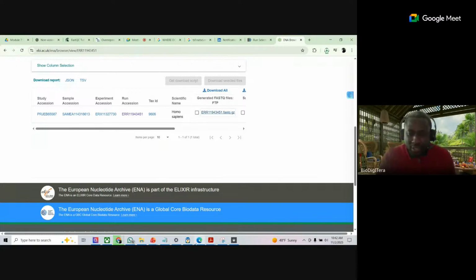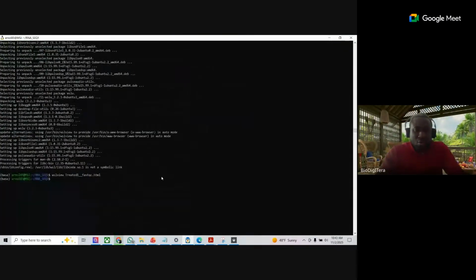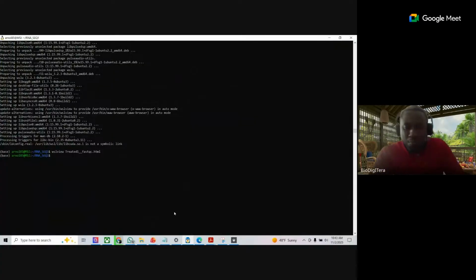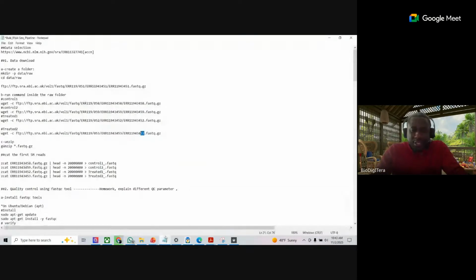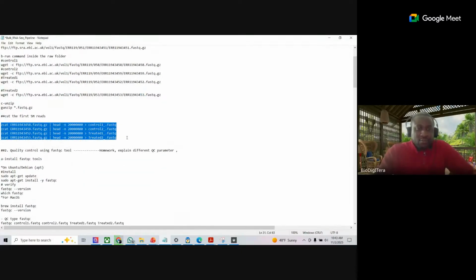Okay, let's go to the next step. So yesterday you downloaded. Now, after downloading, what should we do? We convert it into, I did not explain to you how this thing works. Yesterday you ran this script, right?